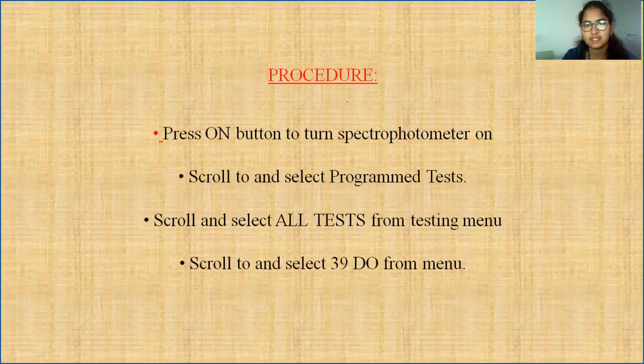Press and hold the off button to turn the photospectrometer off, or press the exit button to exit to a previous menu or make another menu selection. Now we can turn to the laboratory, to see how to determine dissolved oxygen in our environmental engineering lab.